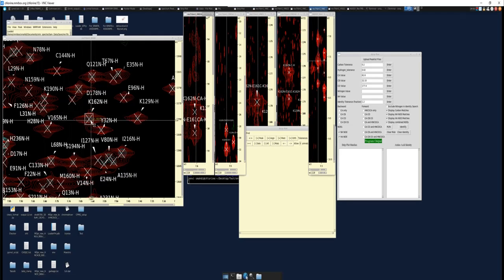So say here, we want to know, I have this amino acid, C alpha at 57.2 and 31.8, right? What could that be? So if we put 57.2 and 31.8, and make sure you click enter, and I click identify. Oh, whoops, sorry, let me get rid of this C. I click identify. You can see you get a number of potential matches. So it could be an arginine, cysteine, glutamine, glutamic acid, histidine, lysine, methionine, or tryptophan.